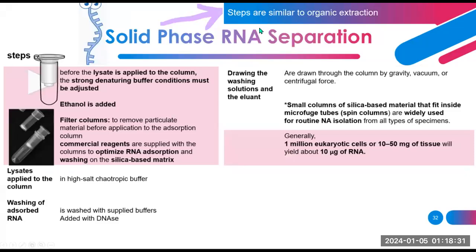So, a more rapid and usually efficient method of DNA extraction involves the use of solid matrices for binding and washing the DNA. So, we have silica-based products that have shown effective DNA binding capabilities in high salt conditions, and various applications or adaptations of this technique have been developed, including the utilization of diatomaceous earth as a source of silica particles. And modern systems are available for purchase featuring solid matrices in the form of columns or beads.